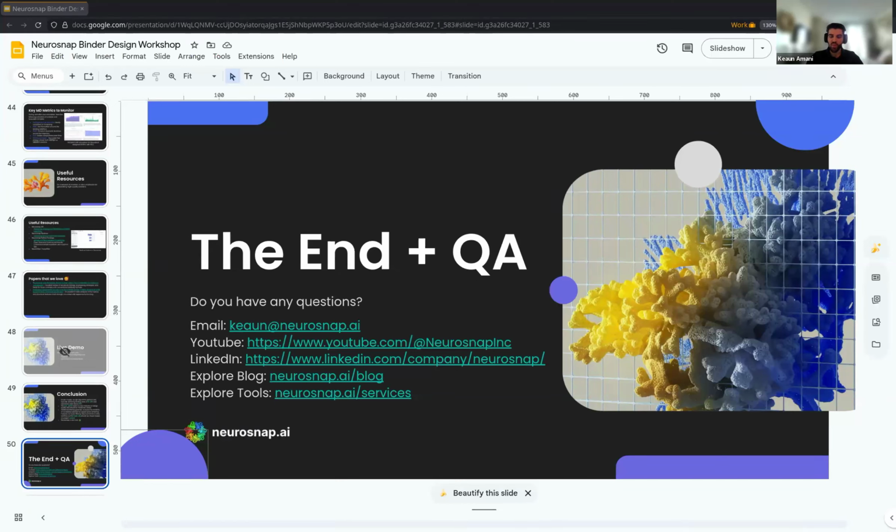In terms of the actual similarity with the wet lab, as we saw for min IPSAE with Chai, the correlation is roughly 0.3, give or take a bit, depending on the target. And in general, that's decent enough. It means that if you have 10 candidates, we've seen success rates around 10 to 20%. So if you have 10 candidates that you want to screen in a lab, for most cases you're probably going to get at least one or two different hits. Hopefully you'll get more than that, but it does depend a little bit on the target. But generally, these models are quite robust these days.